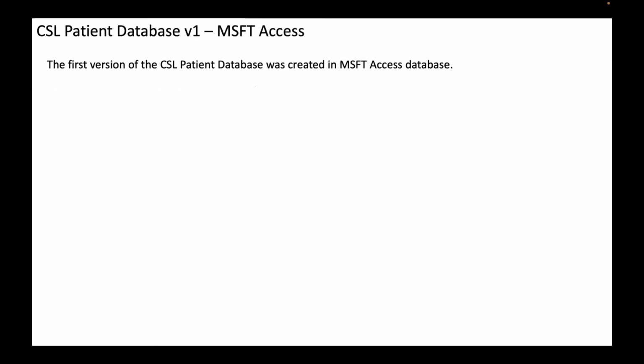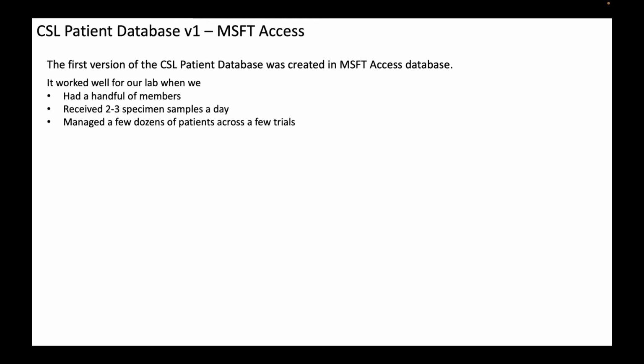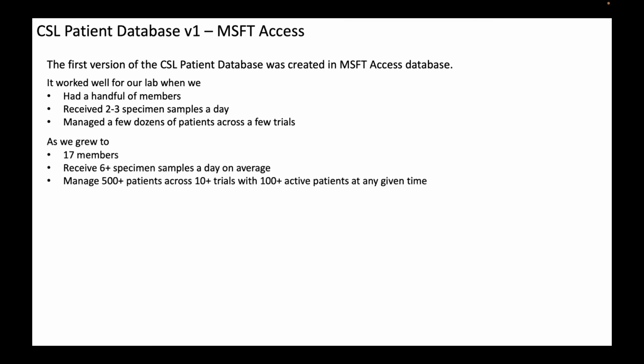So the first version of the CSL Patient Database was developed in Microsoft Access, and this was many years ago when our lab had a handful of members receiving 2 to 3 specimen samples a day, and we managed a few dozen patients across a few trials. So the system worked reasonably well, but today, we have 17 members receiving on average 6+ specimen samples a day, and on a sample-heavy day, it's more like 12 to 15 samples. And we manage over 100 active patients at any given time.